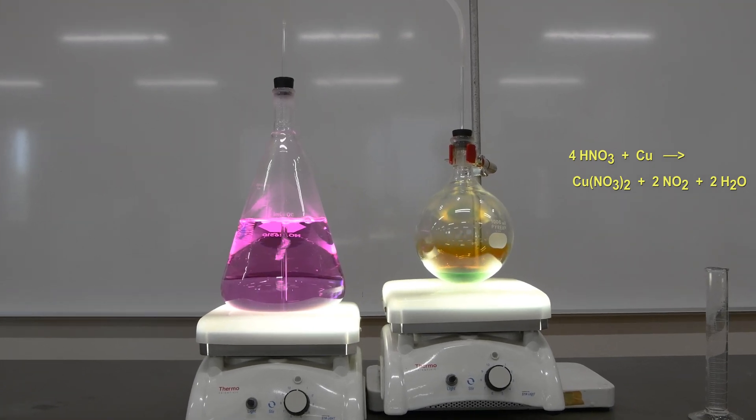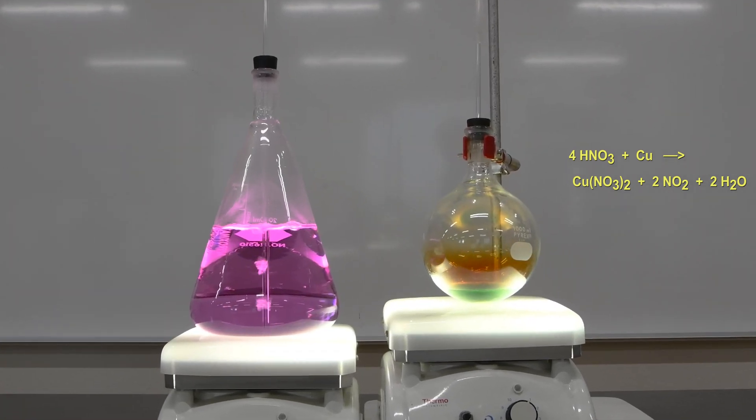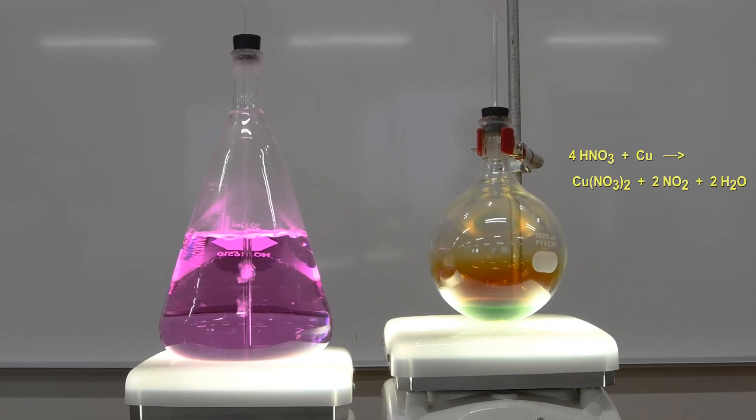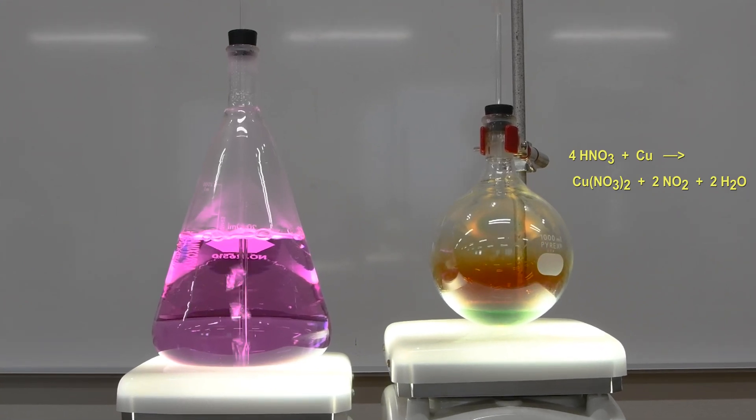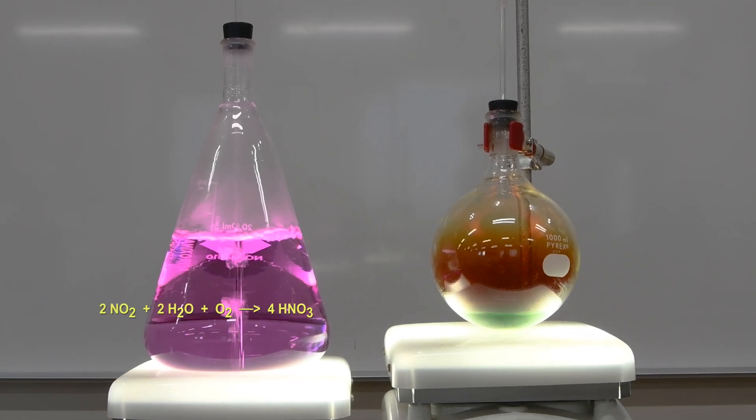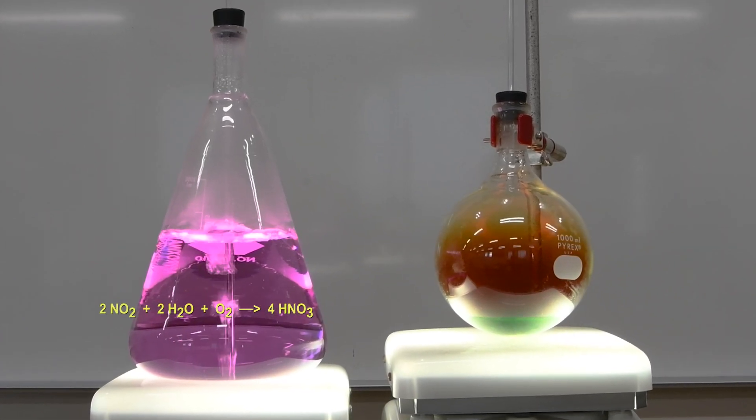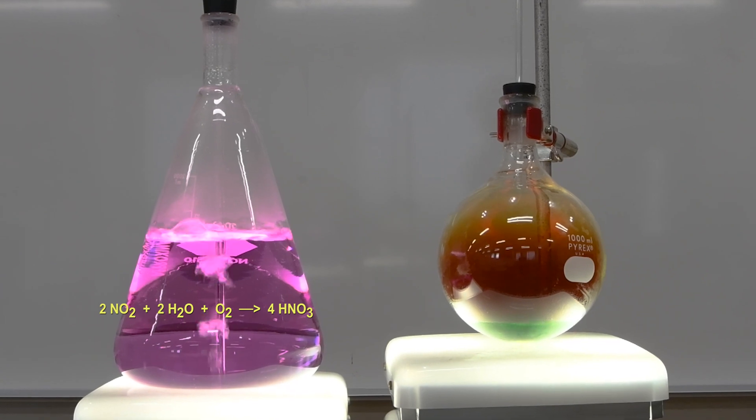You can see that the nitrogen dioxide is beginning to bubble over into our flask. Now the flask, the large flask is pink right now because it's basic, but nitrogen dioxide, when it dissolves in water, forms nitric acid once again, and it's going to slowly turn that solution acidic.